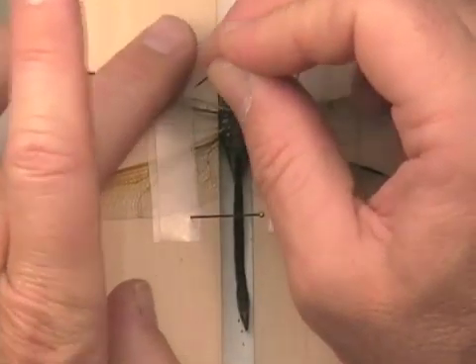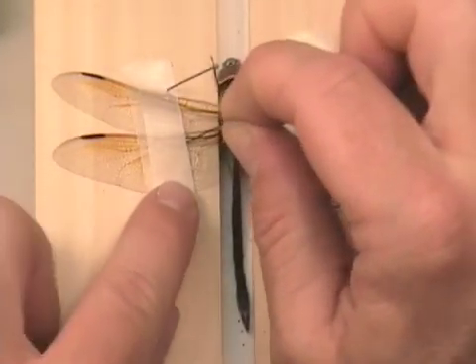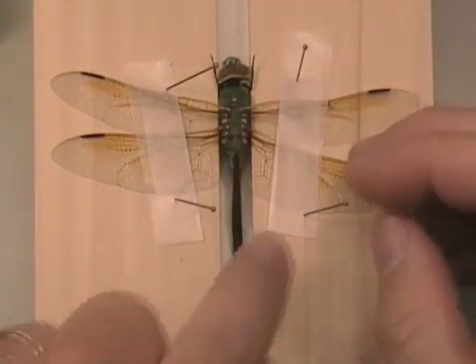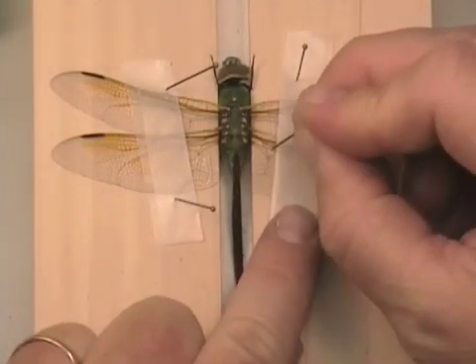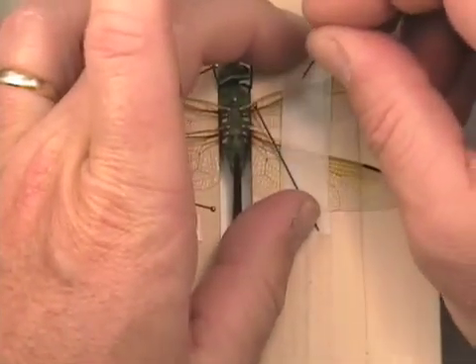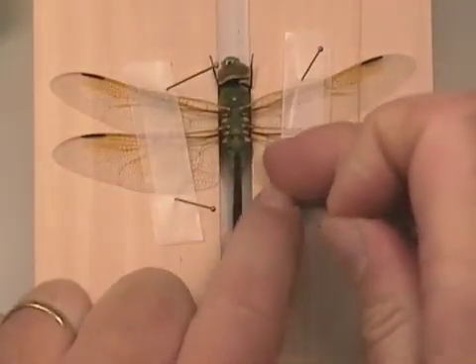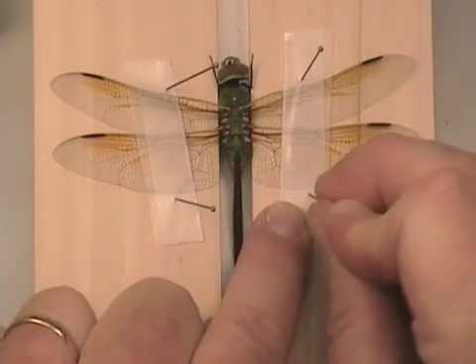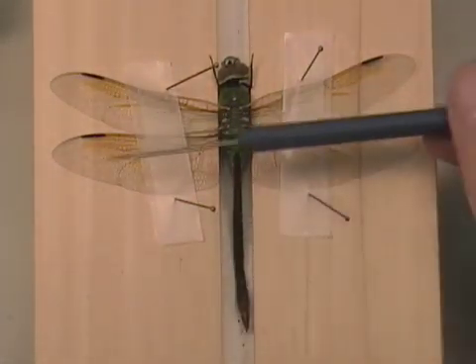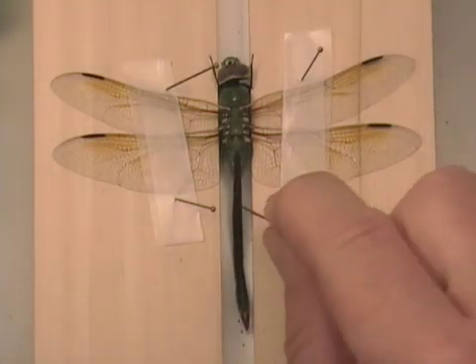We will start by bringing that forewing up a little bit farther — bring it up perpendicular — then position the other side in the same basic position. The leading edge of the hind wing is perpendicular to the axis of the body. So this is a properly mounted, or properly spread, dragonfly.